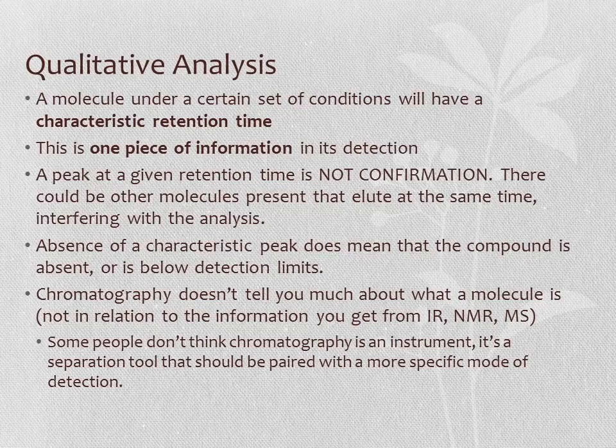Now, what you need to realize is this is just one piece of information about that molecule. Having a peak at a given retention time is not confirmation that the molecule is there. You could have other things that elute at the same time and interfere with the analysis. But while having a peak is not confirmation of its existence, absence of a peak does mean the compound is absent, or rather is below the detection limits.